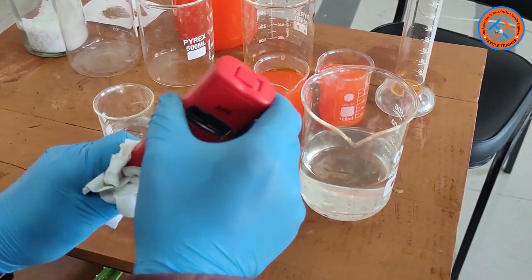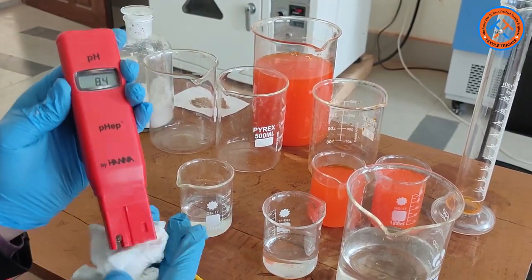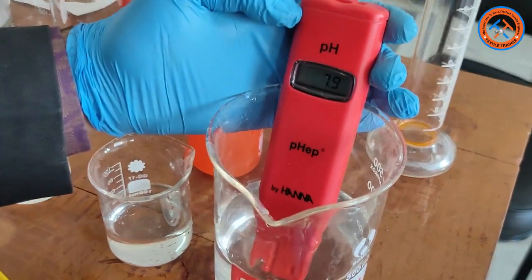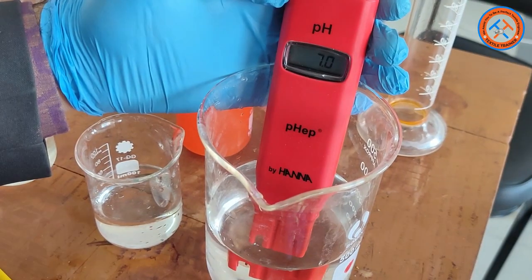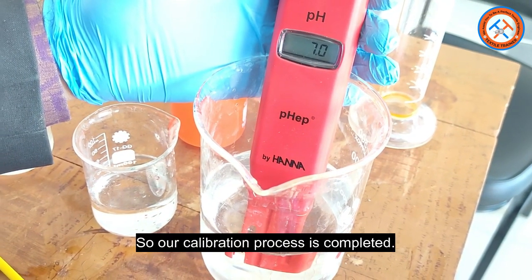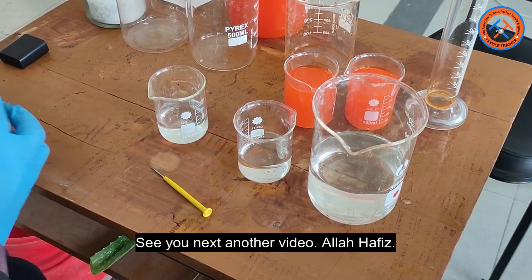Now let's check our pH meter again. We dip the electrode in distilled water — our pH meter now indicates pH 7. As we know, distilled water pH is 7, so our calibration process is completed. That's all for today. See you in another video. Allah Hafiz.